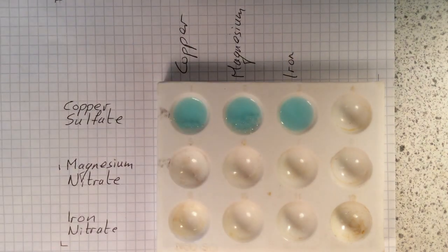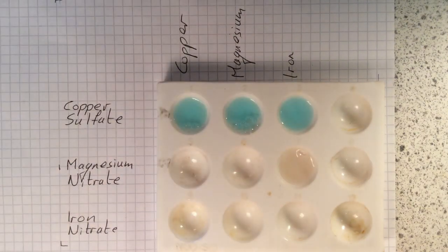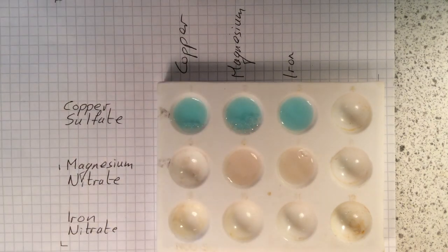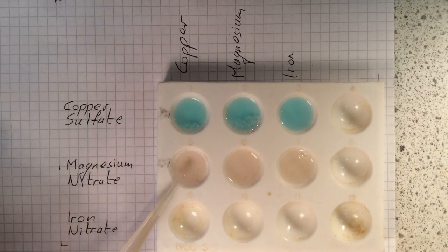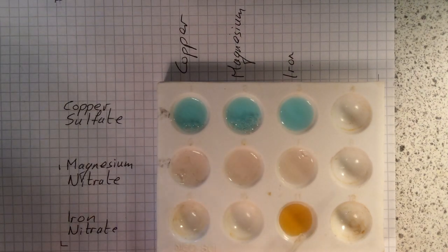These 3 here, I am going to put some magnesium nitrate into those. So I've got another jar of that and a pipette. So that's magnesium nitrate. Just have to take my word for this one. And so all those 3 dimples there are full of magnesium nitrate. And then in the last row at the bottom, we're going to have some iron nitrate.